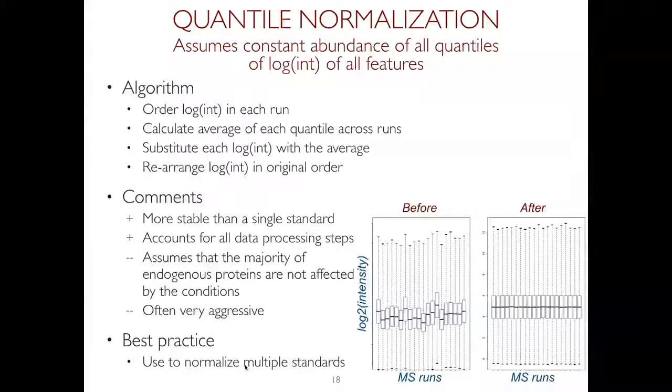Say this again, what if what? What happens if the effects that you're trying to correct for are not uniform? Maybe some peptides are affected or some individual.